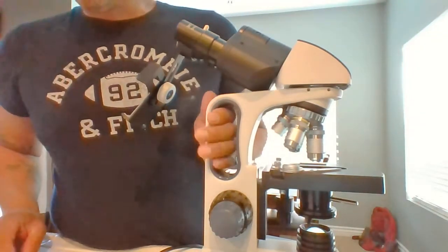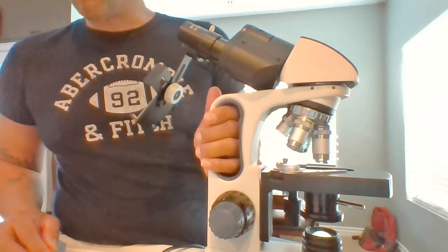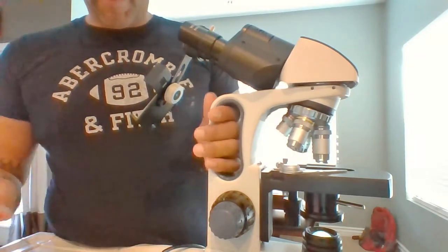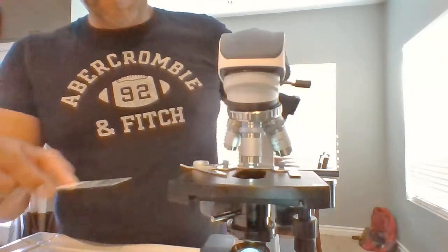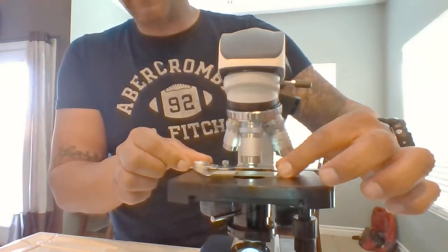Okay, moving on, we're going to look at a few slides that were presented today, but first we're going to go over the eukaryotic cell. It's a single cell that has no definite shape. So for video purposes, I'm going to grab the amoeba cell, and that is here. I'll put it on the stage.